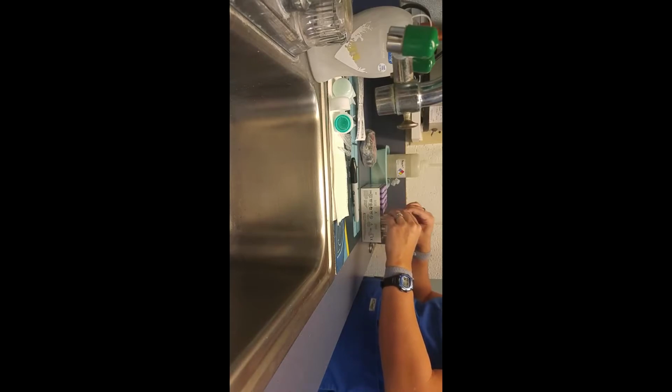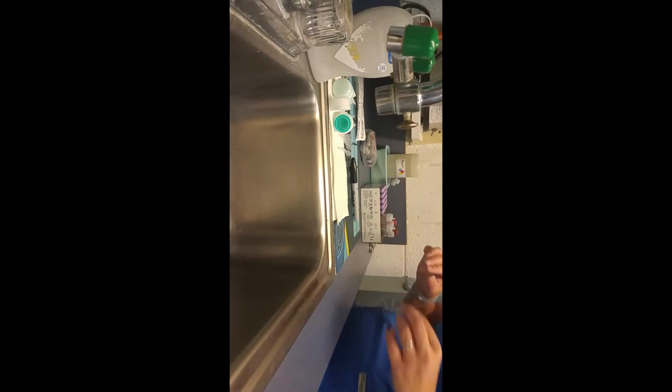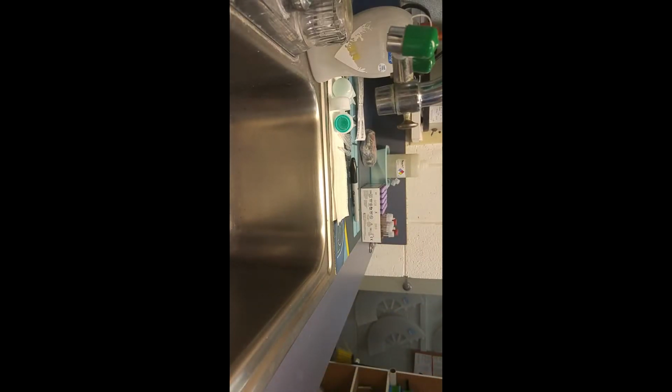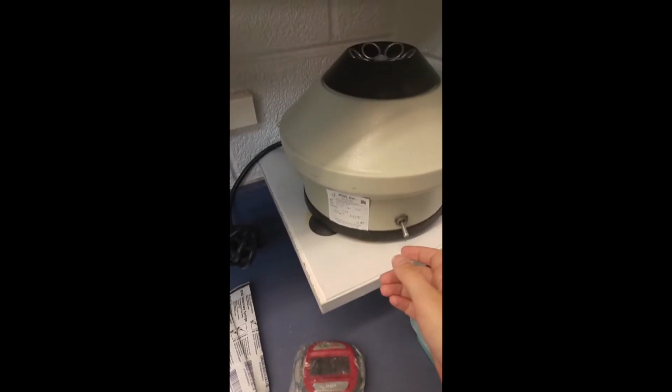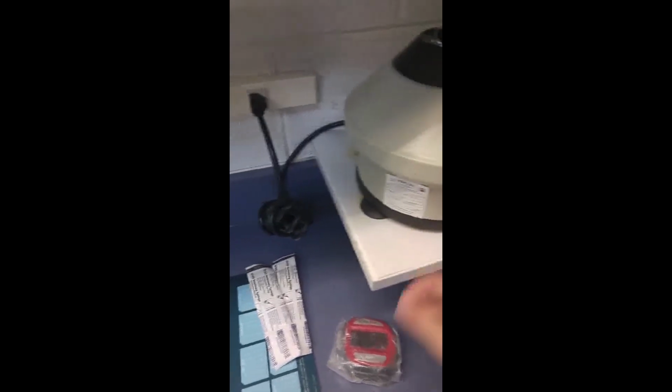For about 30 minutes. And then once we come back, we'll examine them for some hemolysis after we centrifuge them. So we're going to go ahead and centrifuge all four tubes that are in there for a minute.